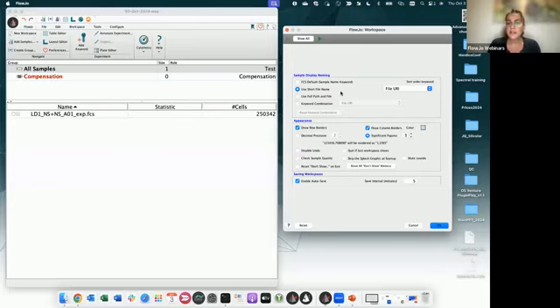And since we are here, I want to highlight, in case you have never seen it, that you can enable auto saving of your workspace in this area right here. When you enable auto saving, FlowJo will automatically save your workspace every interval of minutes that you decide. I have it set to 5 minutes, but you can set it to 3 minutes, 7 minutes, 10 minutes, whatever you prefer.